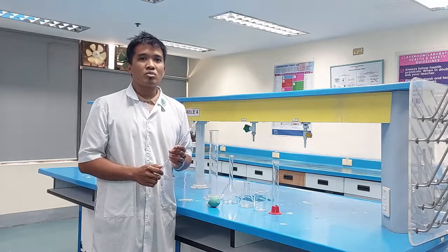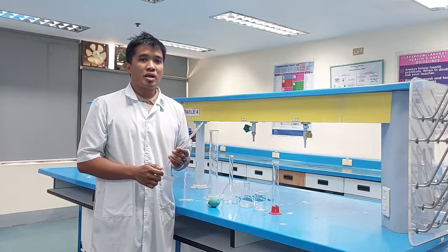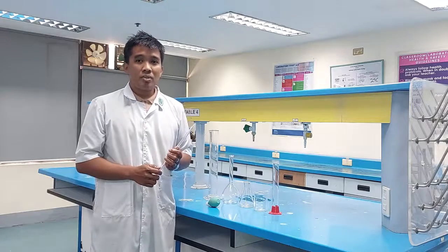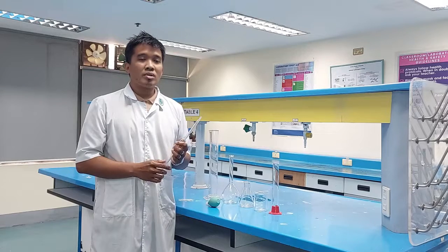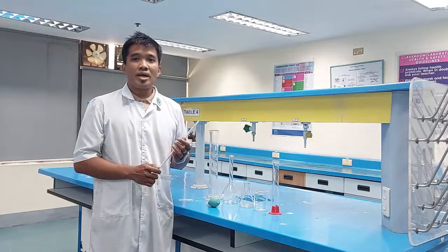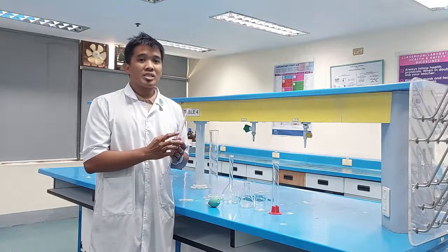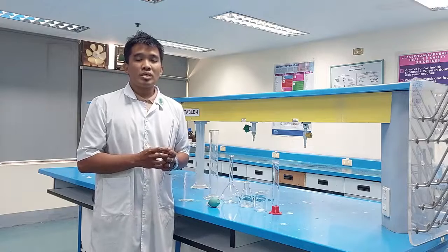Pipettes are usually used to measure liquid volumes of 10 ml or less, although larger pipettes are available. Pipettes come in two types: to deliver, usually labeled TD, and to contain, usually labeled TC. A label near the upper end of the pipette shaft indicates the type of pipette. Most pipettes that you will work with will be the TD type.